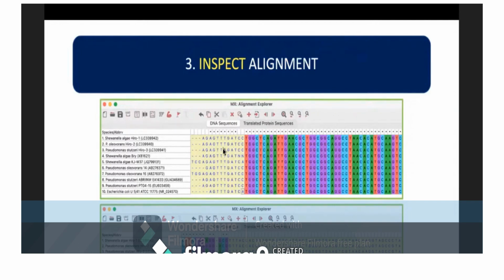is not similar. So from here you can delete or remove the sequence one by one, or select it and go to the scissor or the cross button, so you can easily remove this sequence from the forward and from the tail side. Upper image shows the forward side and lower image shows the tail side.